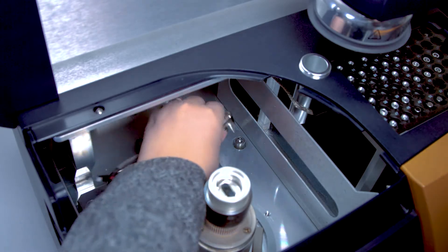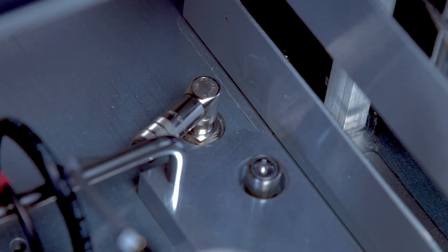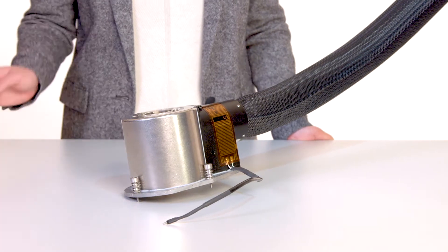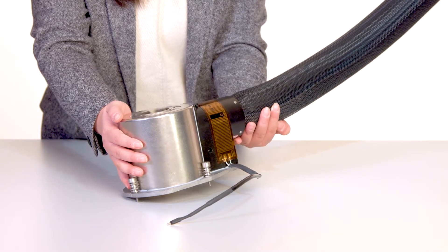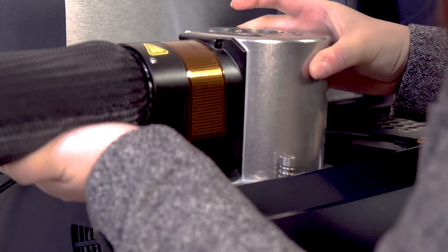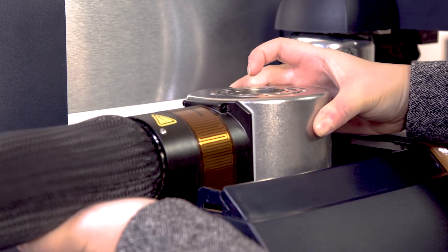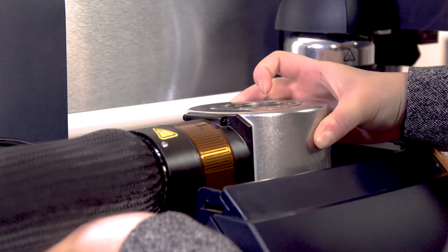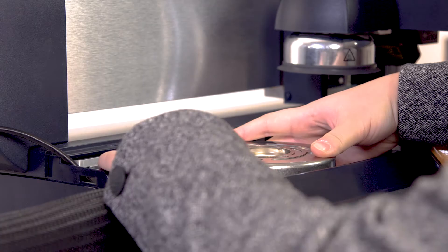Plug the heater cable into the port. When you hold the cooling head, make sure your hand is supporting the neck of the head. Align the pin on the cell base with the corresponding slot in the RCS cooling head and carefully place the cooling head over the cell. Be careful to avoid bumping the top surface of the cell with the head.